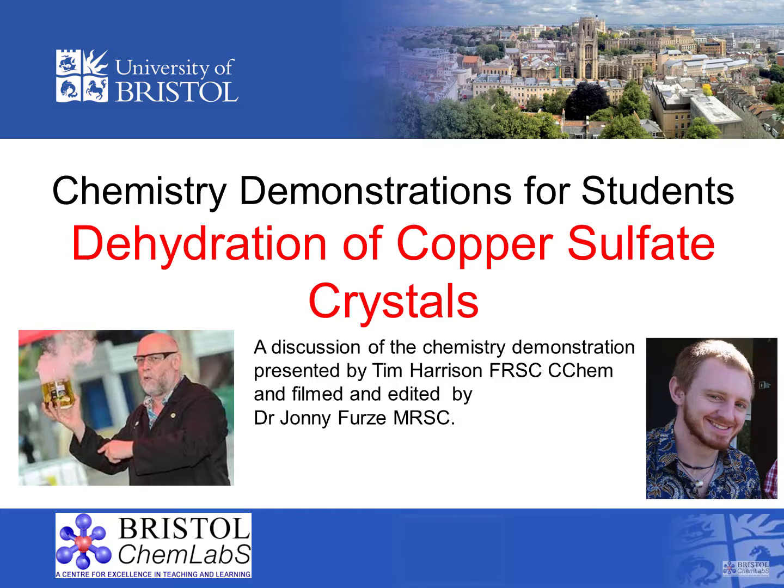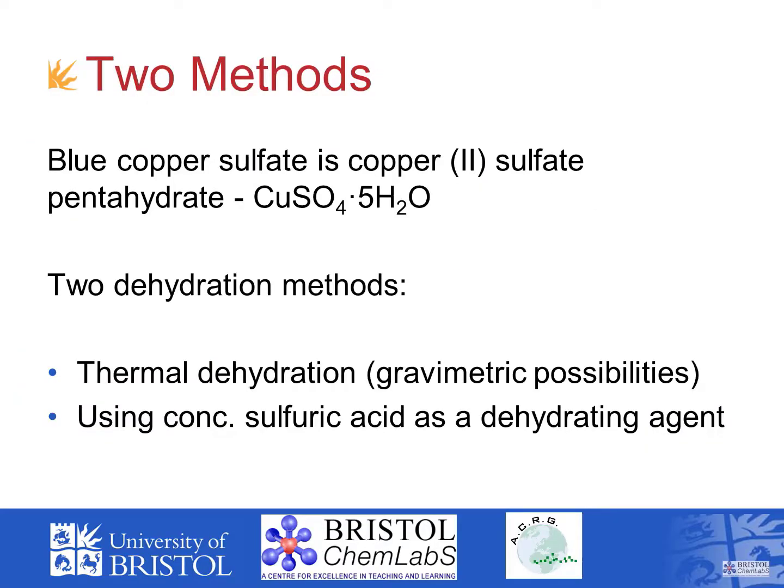In this video we're going to look at a number of ways of dehydrating copper sulfate crystals. The blue copper sulfate crystals that everybody knows is copper sulfate pentahydrate. In other words, CuSO4.5H2O. It's the hydrated form of copper sulfate. It contains 5 molecules of water of crystallization.